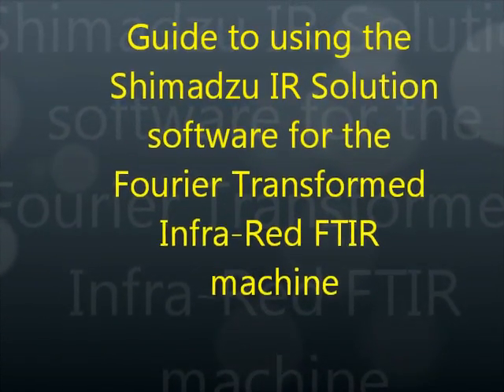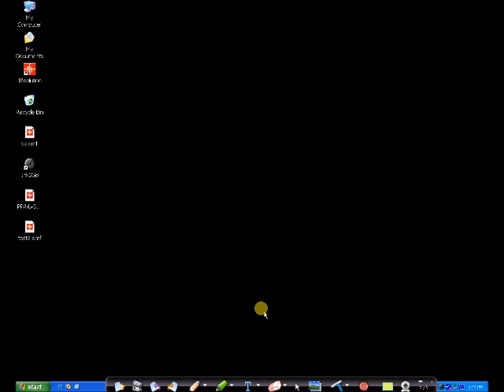Welcome to the video for the guide to using the Shimadzu IR Solution software for the Fourier transform infrared FTIR machine. On your computer desktop, please double click on the IR Solution icon.